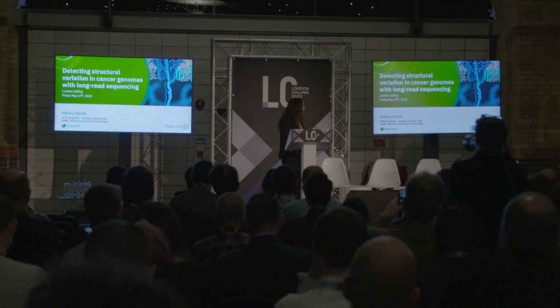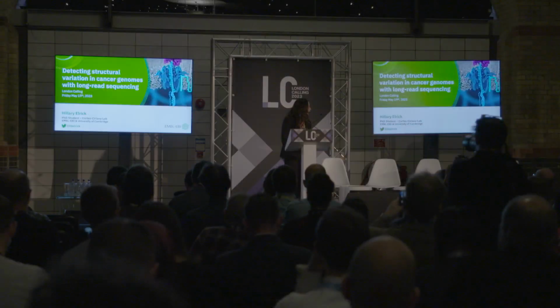I'm going to be talking today about detecting structural variation in cancer genomes with long-read whole genome sequencing.